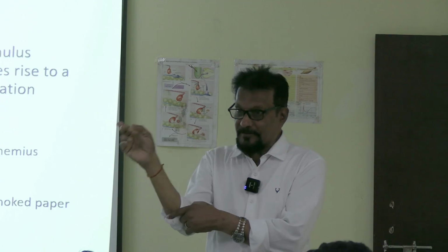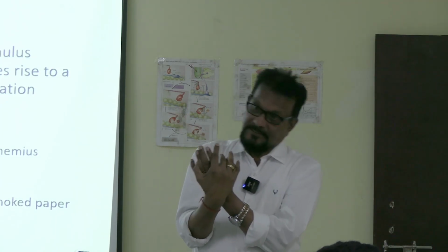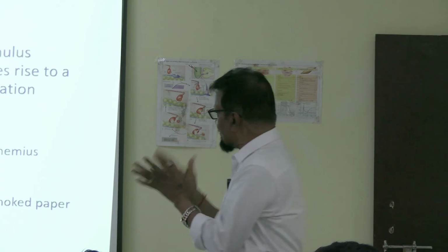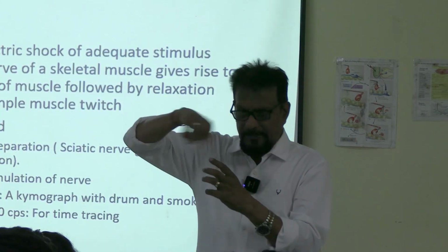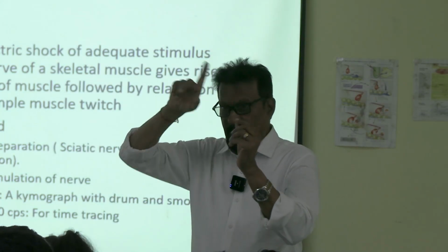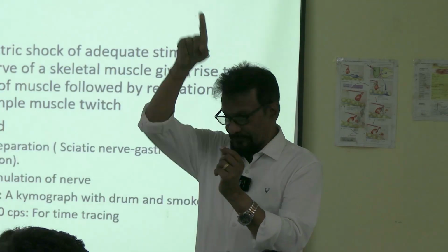The muscle will contract. How can we record this? We can record it with this setup. The other point is that there will be a moving drum, and on it the graph will be inscribed. So it is against time.